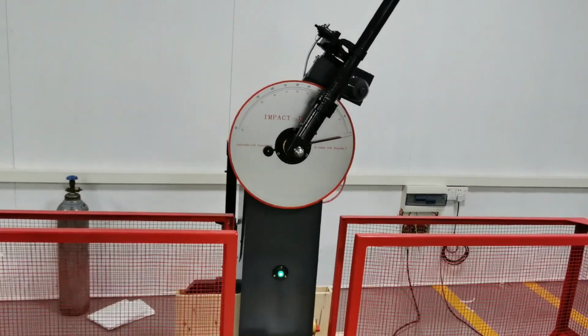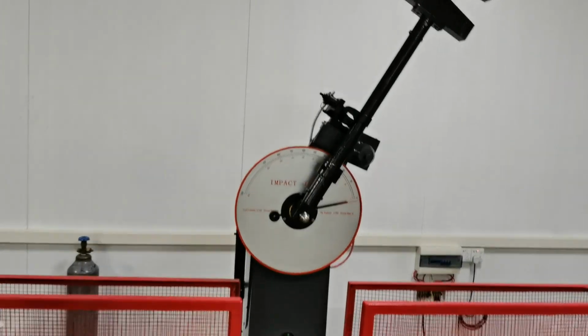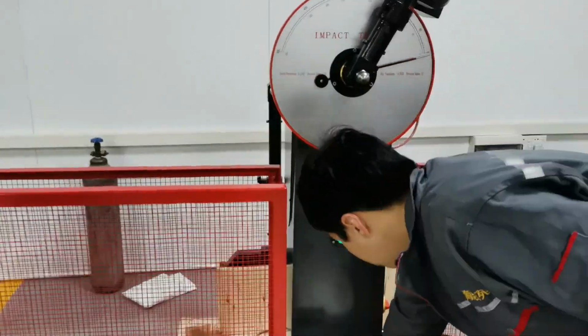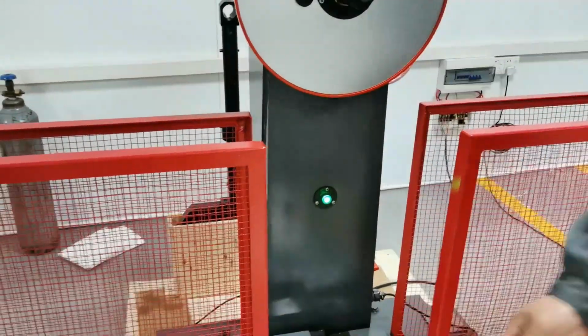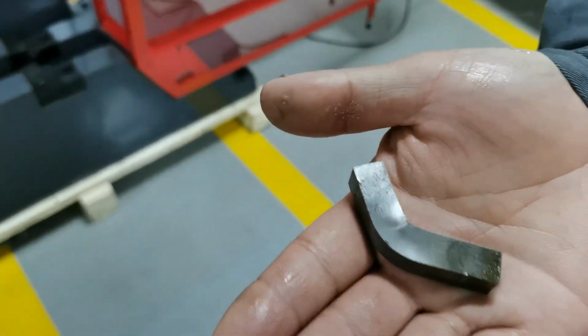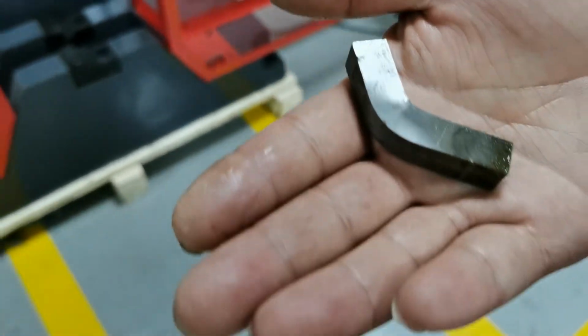And then to do the next step, usually we will do three times. Now this is the sample, your sample after being tested.